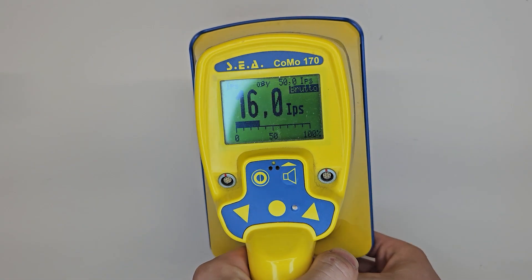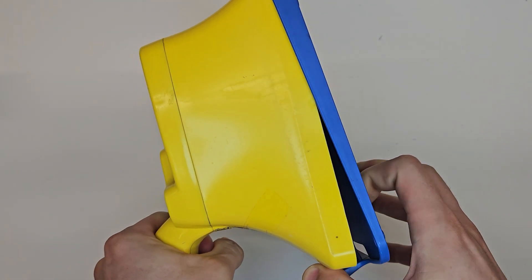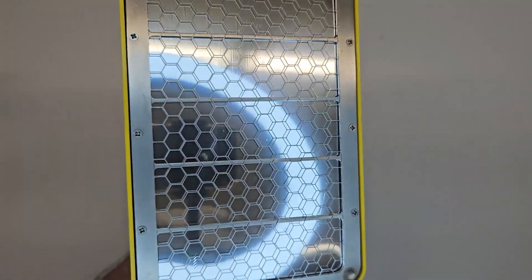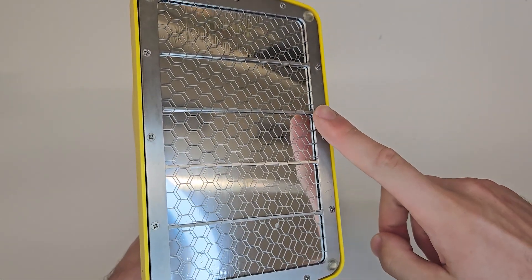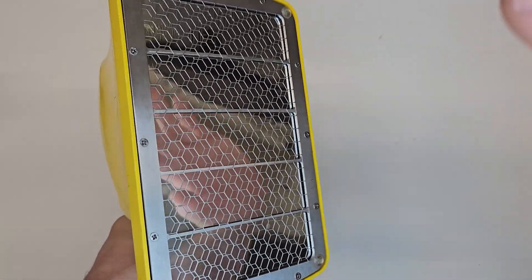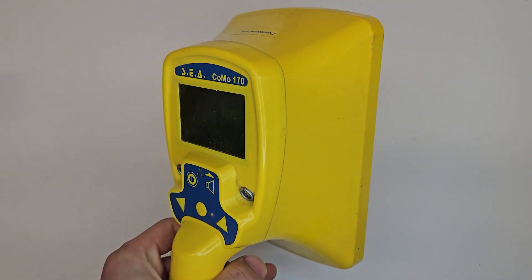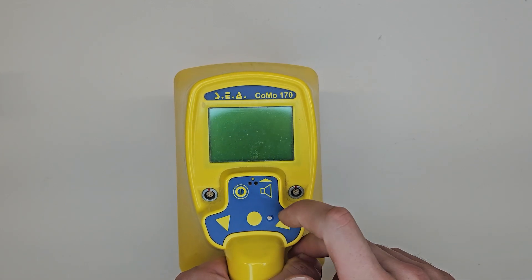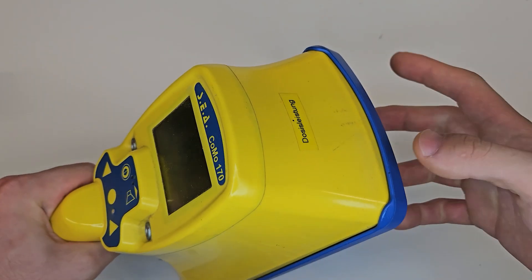One common comment: "You hold the detector wrong — it measures at the bottom, you dumbass." Yes, a classic KOMO 170 really does measure at the bottom, and that's true here too. But this is the KOMO 170D. Unfortunately, it doesn't say that on the detector. This version is also equipped with a Geiger-Müller counter to measure the dose rate — hence the D.